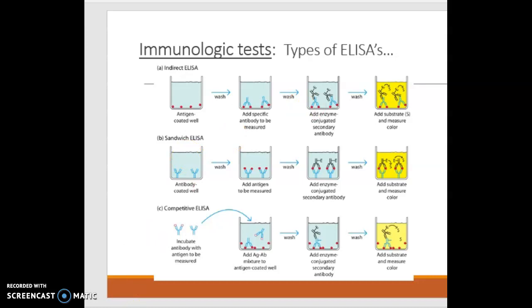These secondary antibodies bind to the primary antibodies, any free secondary antibody is washed away, and a substrate for the enzyme is added.